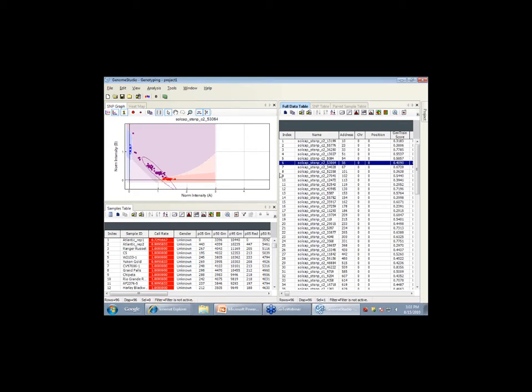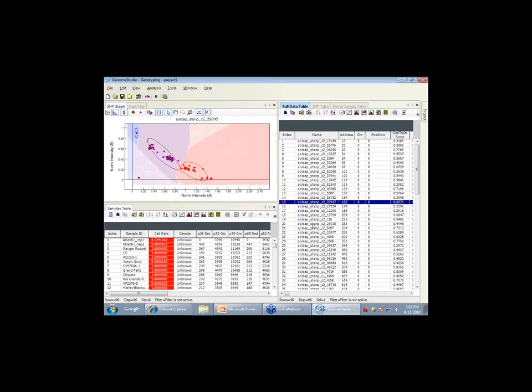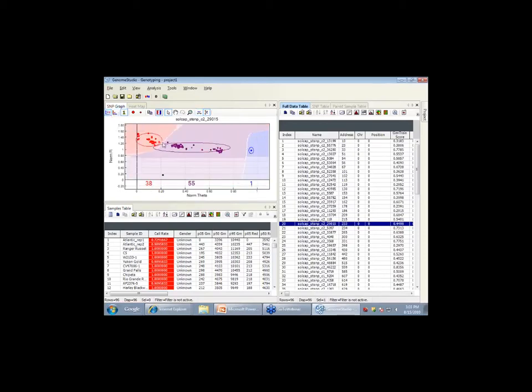So you can basically scroll through the different markers, and you start seeing them. Here's a nice one, number 20, where you see the 5 clusters pretty nicely. Unfortunately, you can't change any of the clusters here. To change, you have to go back to the polar view and start playing with using the shift key and changing where the clusters are.